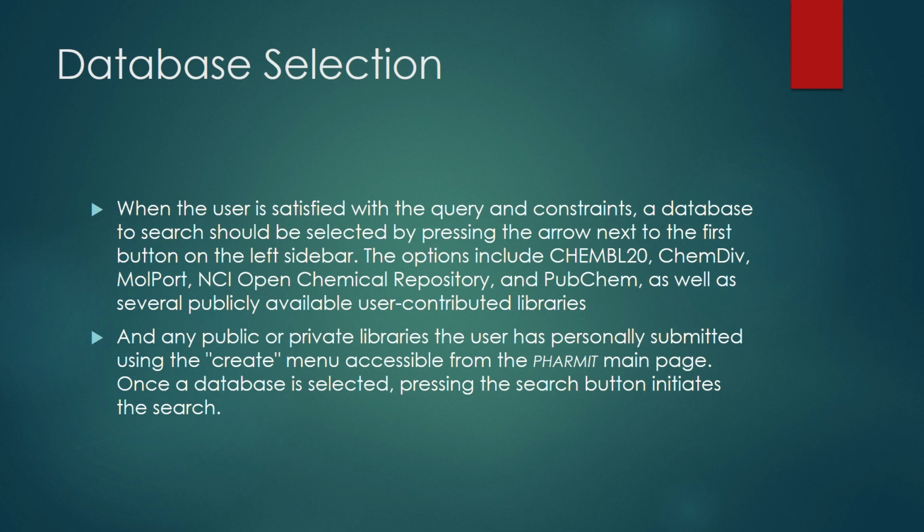Once a database is selected, pressing the search button initiates the search. The user can also use their own created and submitted libraries through the create menu accessible option, and then they can start their searching process.